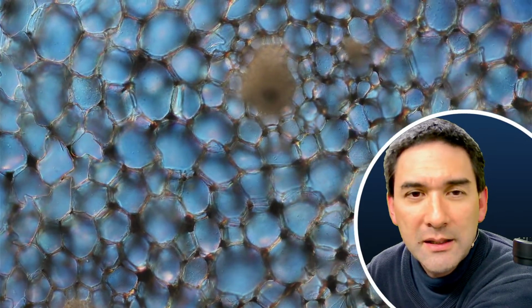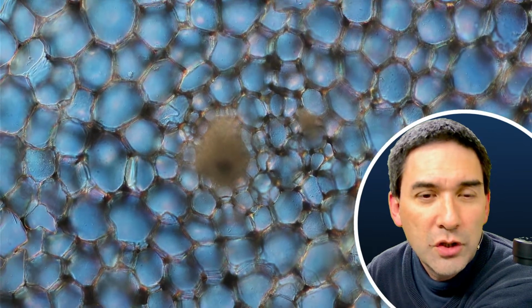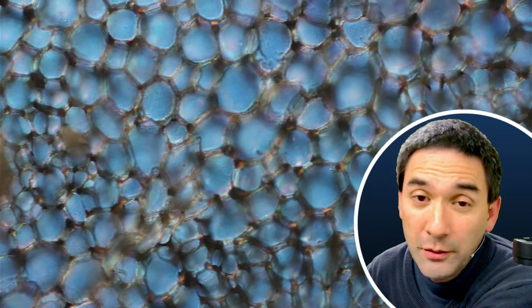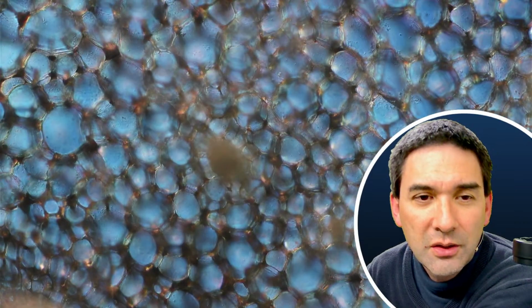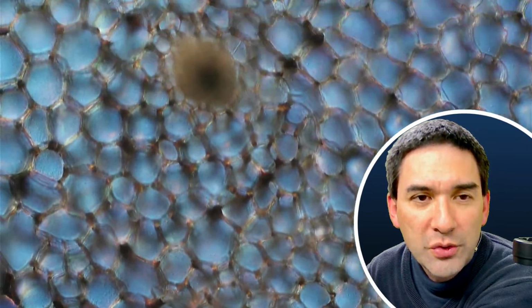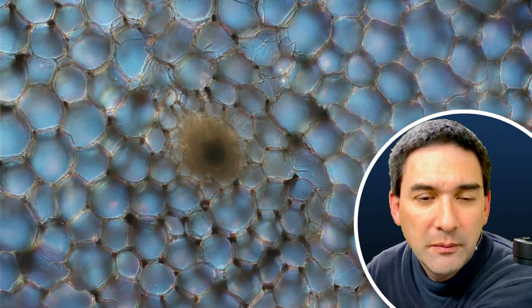So specimen preparation is not so easy. That's why for quick mounting and also for educational use, water-based mounting media might be an advantage.